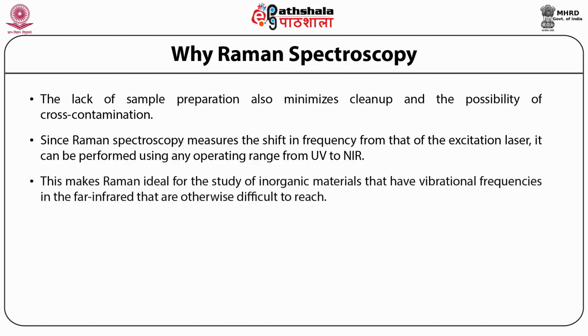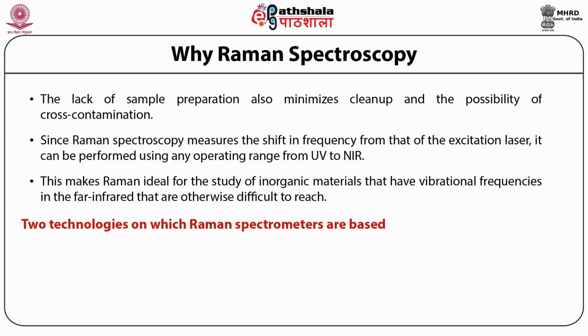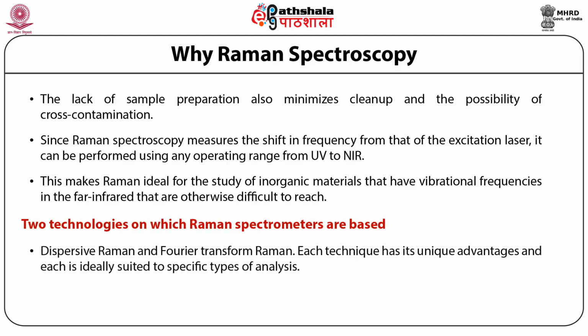This makes Raman ideal for the study of inorganic materials that have vibrational frequency in the far IR that are otherwise difficult to reach. Two techniques on which Raman spectrometers are based: Dispersive Raman and Fourier transform Raman. Each technique has its unique advantage and each is ideally suited to specific types of analysis.